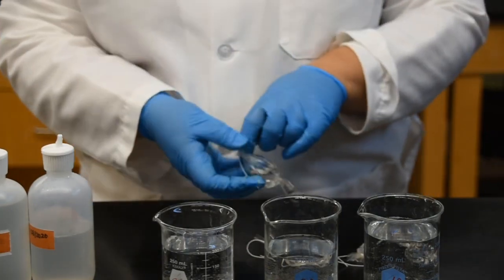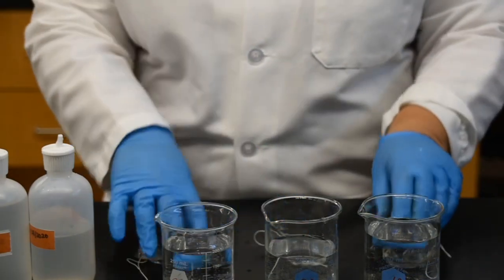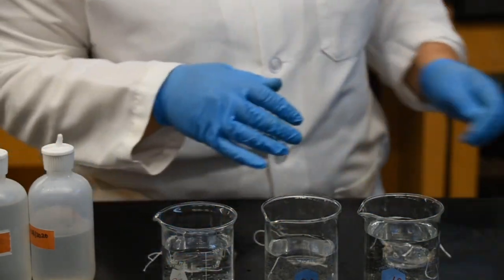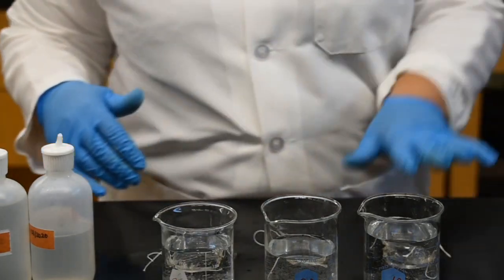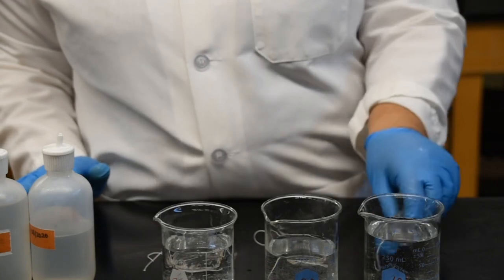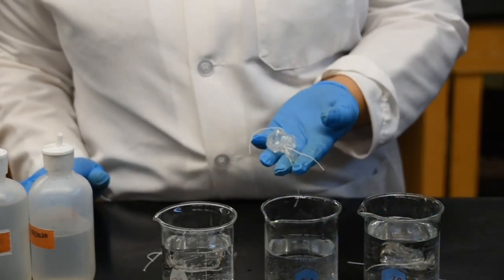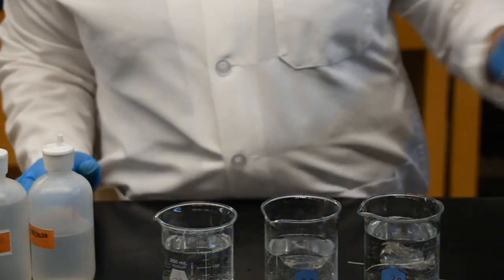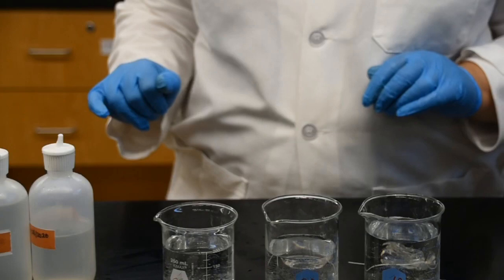Okay, so now I have my three baggies. I have a 10% baggie, a 20% baggie, and a 30% baggie. I've already weighed the other two for you. So the first one is a 15.5 gram weight. My second baggie is 12.6 grams in weight. And the third one is 13.5 grams in weight.